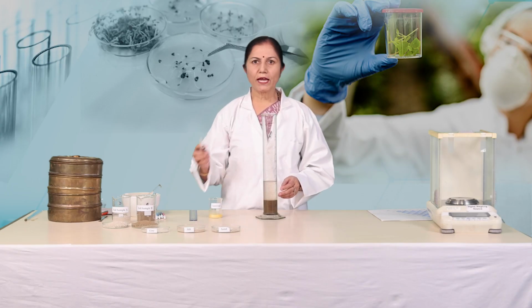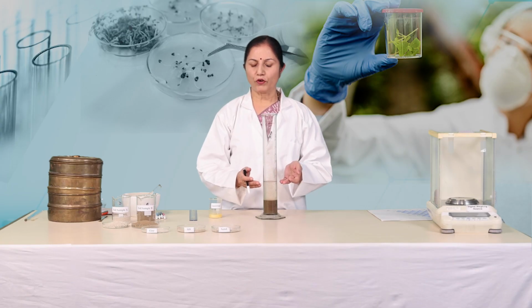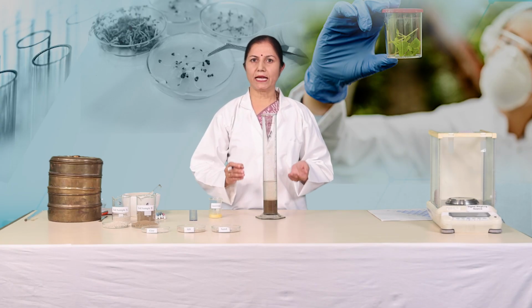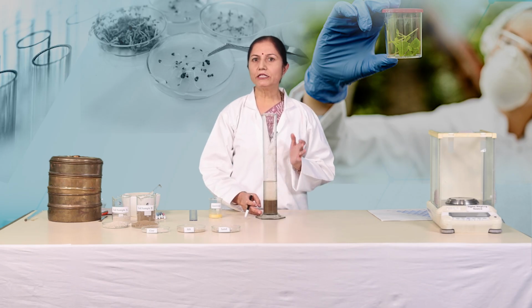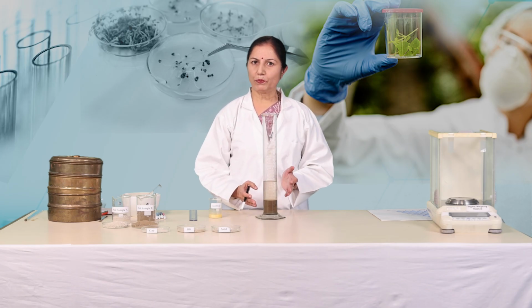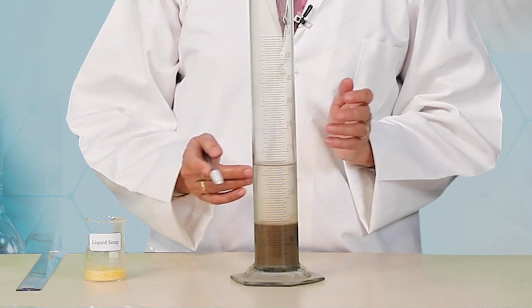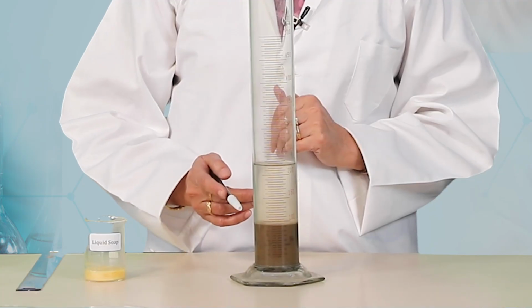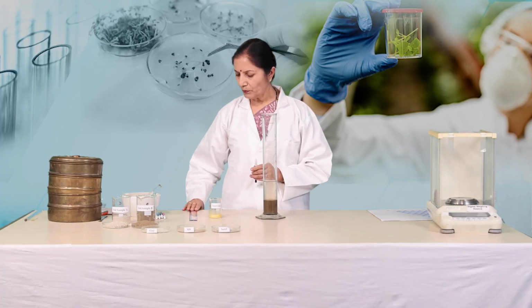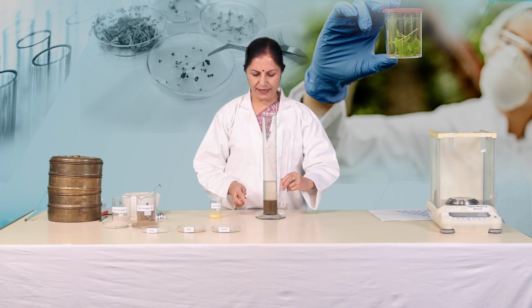Mark these with the help of a marker. At the top will be the layer of water, followed by clay, silt and then sand. Sand particles being heavier than silt and clay, they will settle at the bottom. Clay layer will be at the top just below the water layer. Now, with the help of a scale, measure the length of each layer.